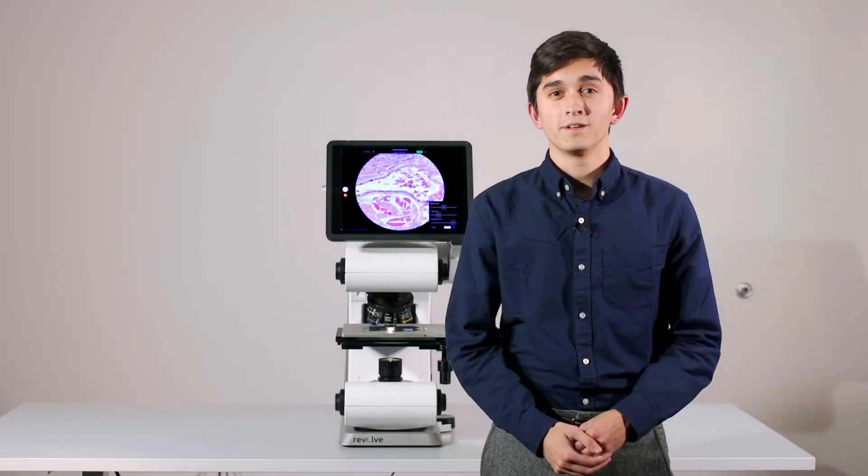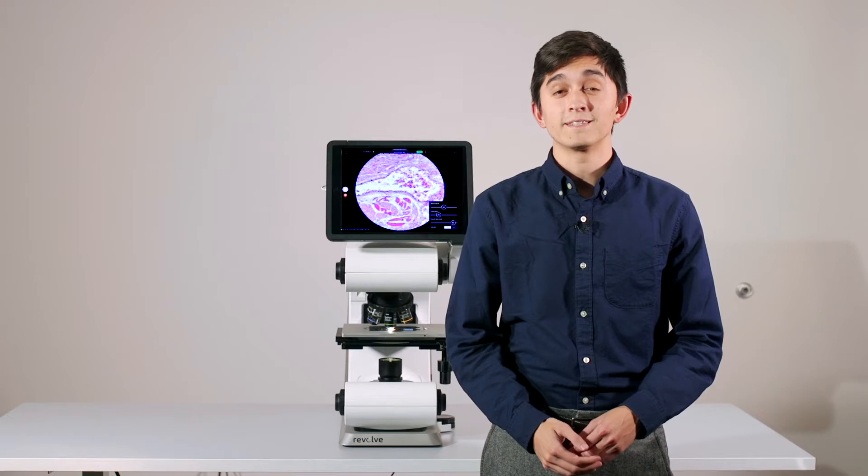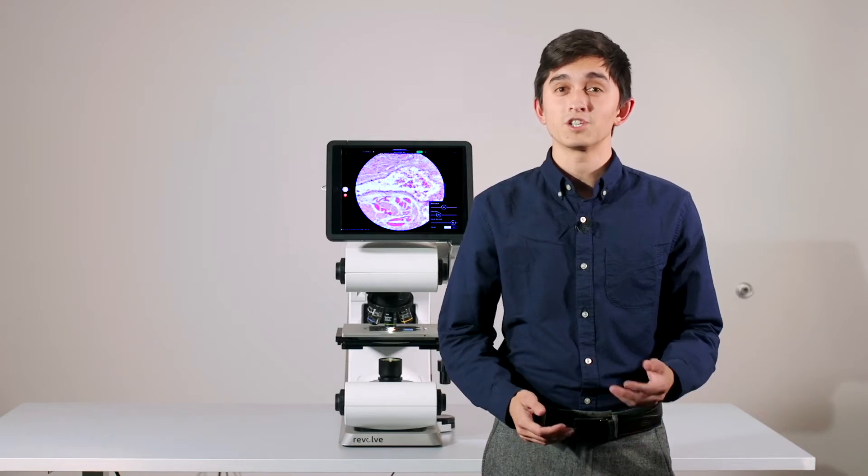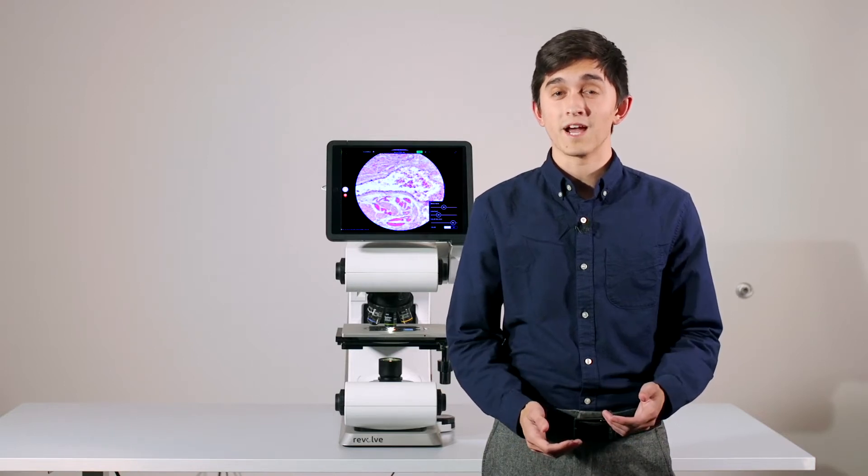Hello and welcome to Echo. We are excited today to show you the Revolve, the microscope that has changed the way you view science.